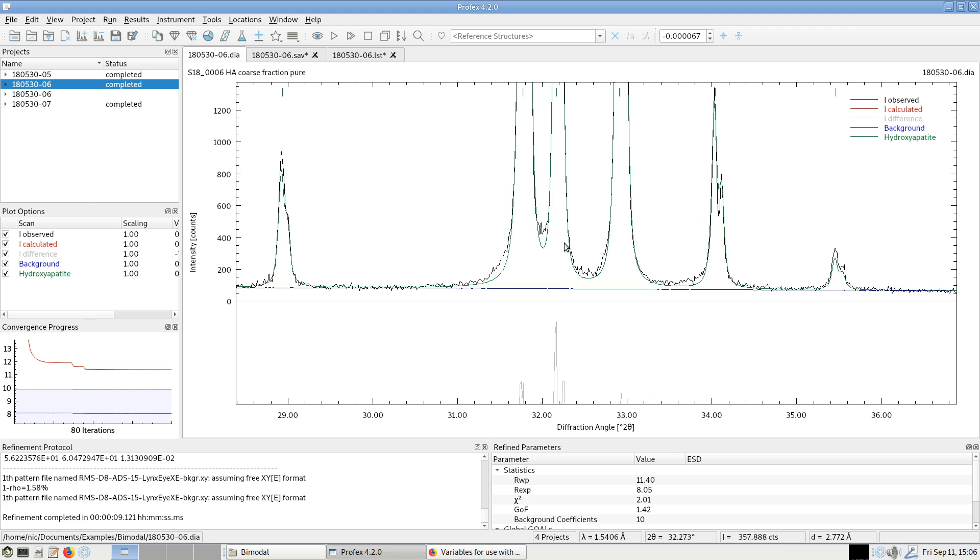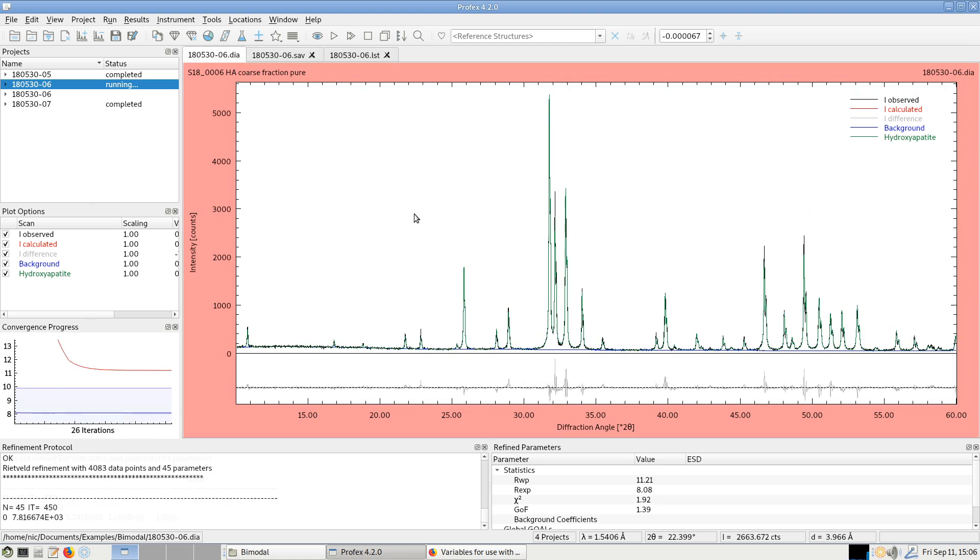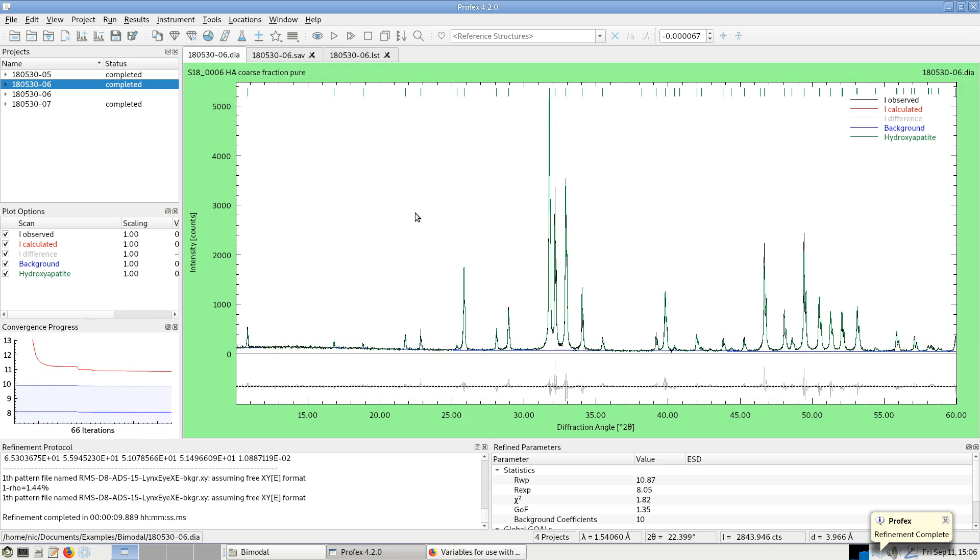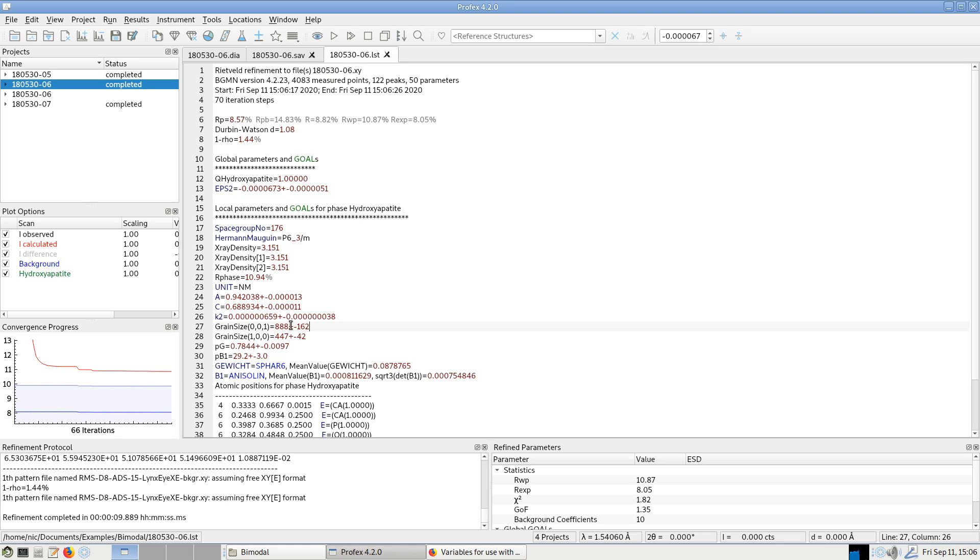But this phase actually is a little bit over milled. And we can also refine this one with the bimodal structure file and look at the list file. And it's still smaller, but it's a lot larger now. We have now 888 nm by 447 nm.